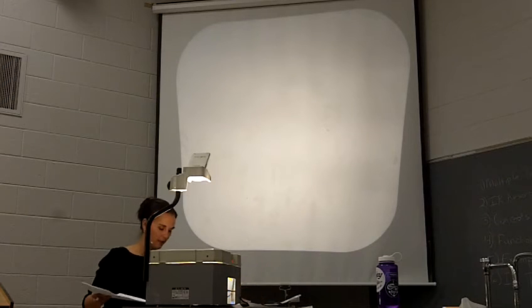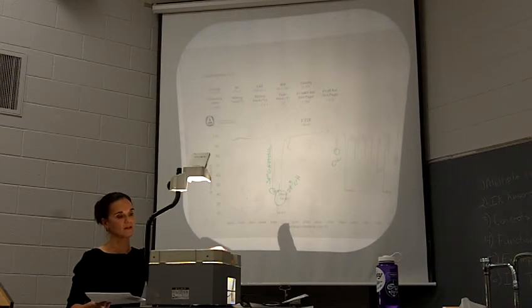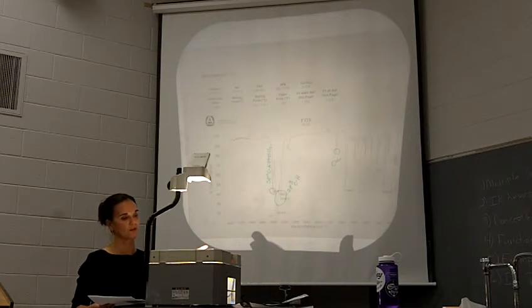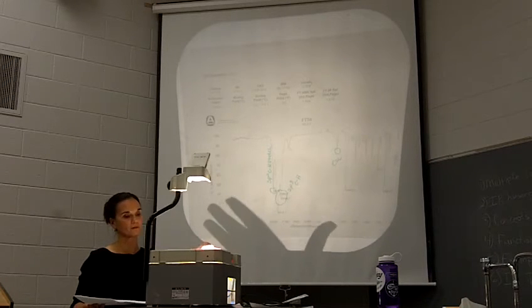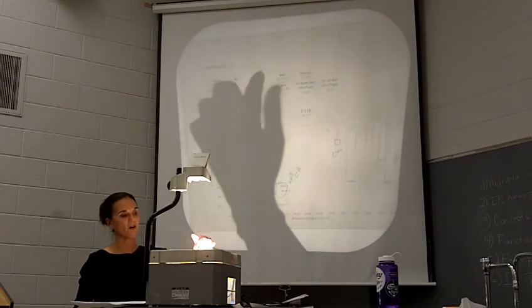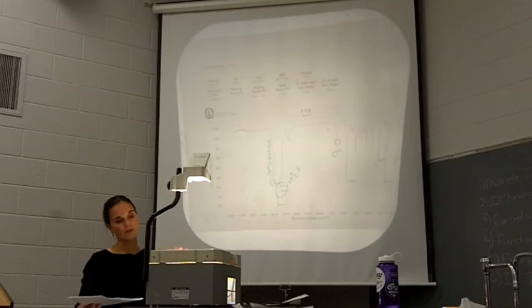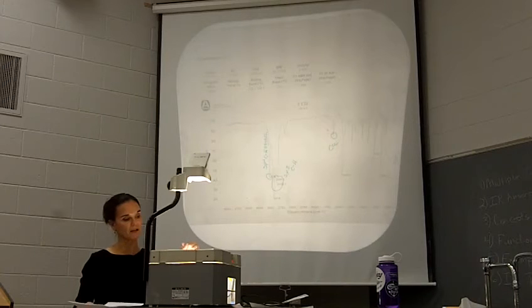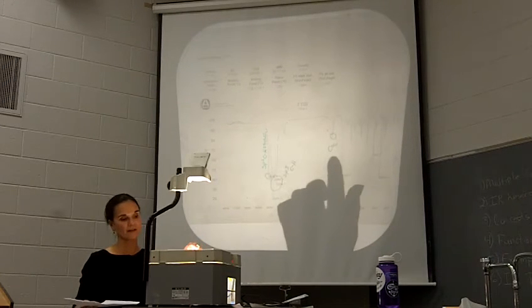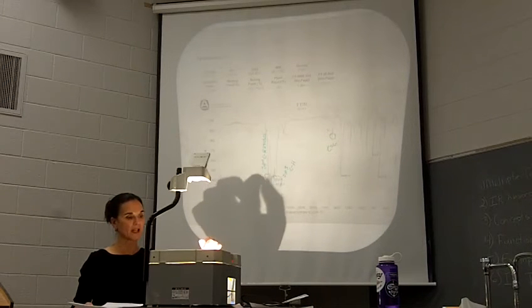So now let's look at spectra of different compounds with different functional groups. The first one I have is cyclohexene, and so it is an alkene, okay? And so this is a characteristic spectrum of an alkene because around 1600-ish, we've got this C double bond C stretch, right? And then we also have an sp2 CH stretch.